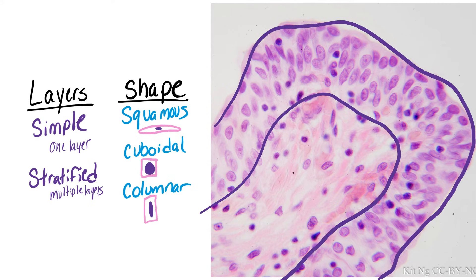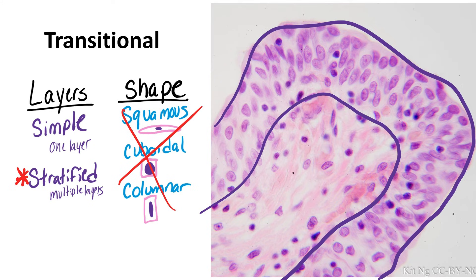Looking in the epithelial layer, we see multiple layers of cells, so this is a stratified epithelium. And when we think about the shape, we feel confused, because they're not squamous, they're not cuboidal, they're not columnar. When you see that, it means you are looking at transitional. Transitional epithelium is a stratified epithelium — we just don't say the word stratified in the name.